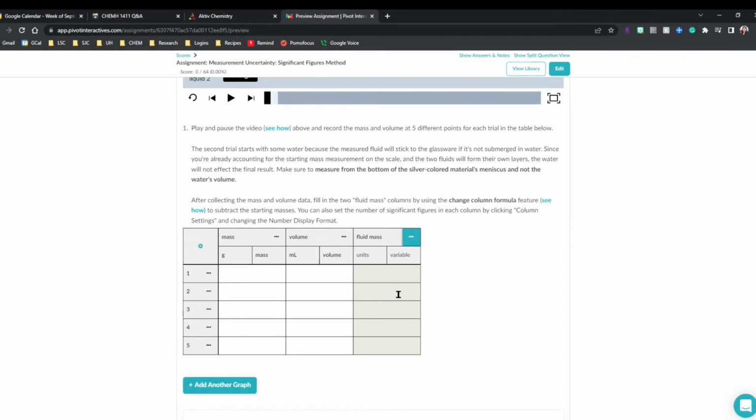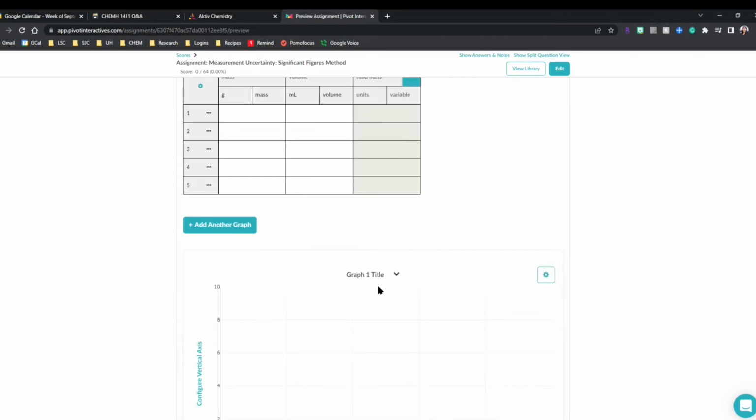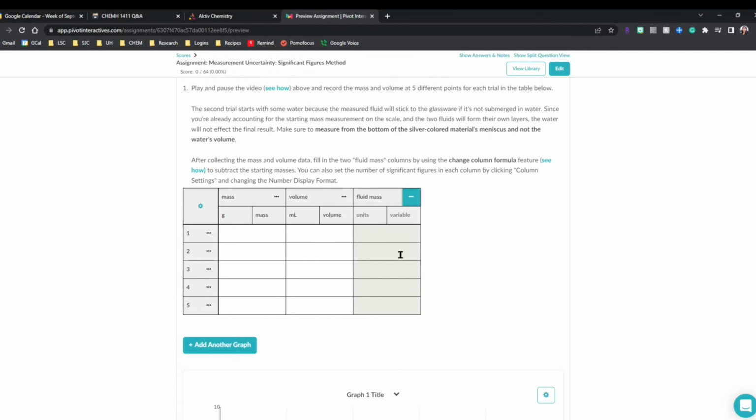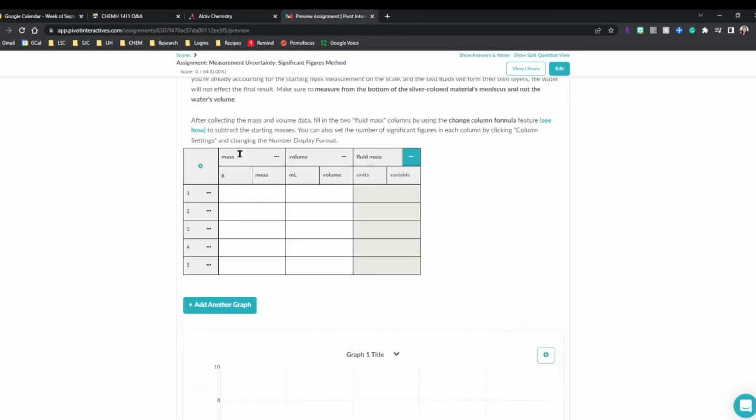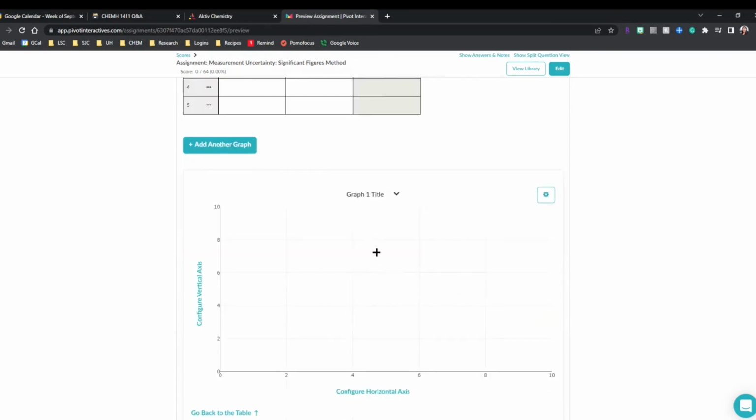That's affecting it. It's going to make your density way higher than it's supposed to be. Okay, so you're going to do this for both fluid 1 and fluid 2. What you're going to end up with is 6 columns. Just keep in mind, I should end up with 6 columns. And then that's your table done.